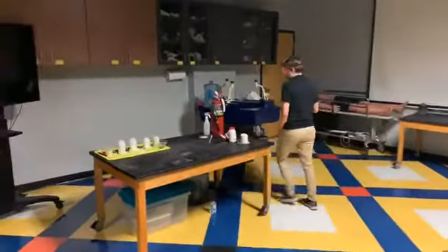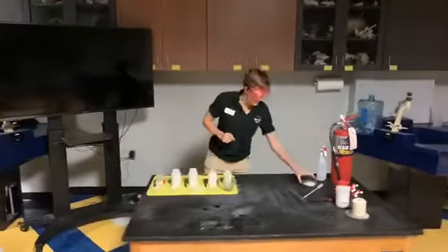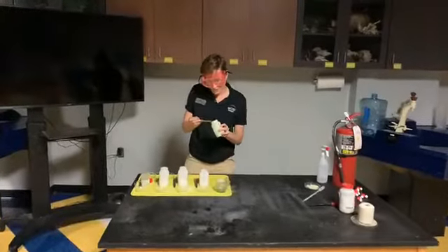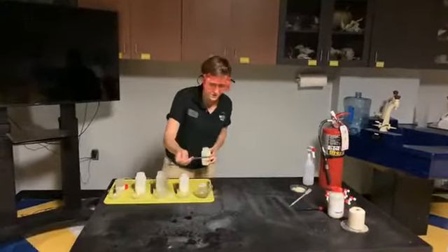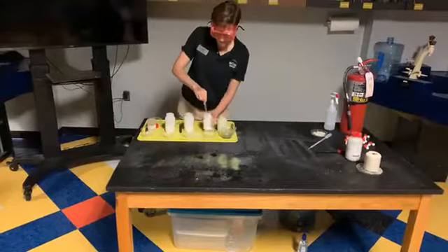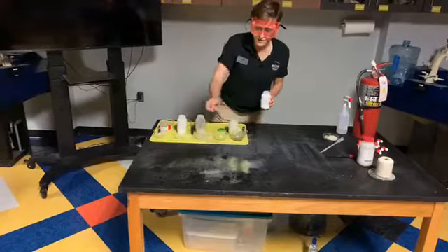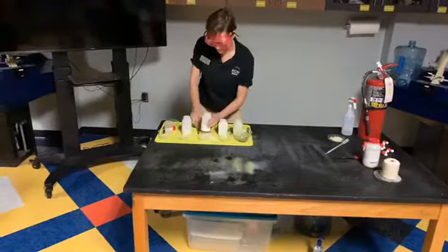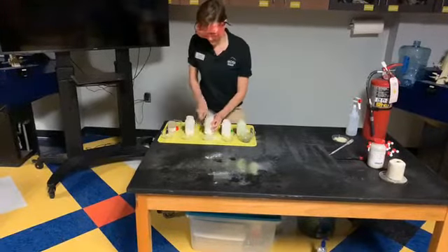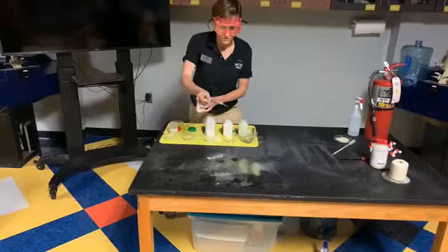All right. I want to do one more thing to kind of take us out. You got to see some of those different salts earlier. And you know that they make different colors. And you can actually mix them together safely to get what I like to call a rainbow flame.